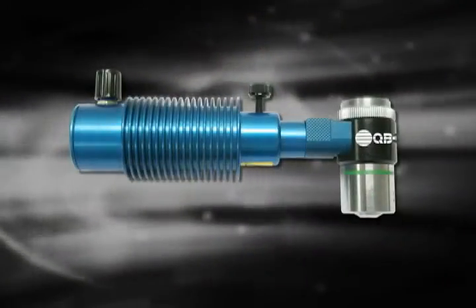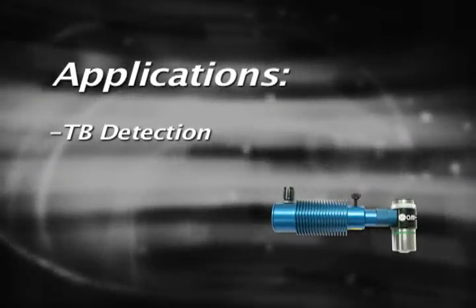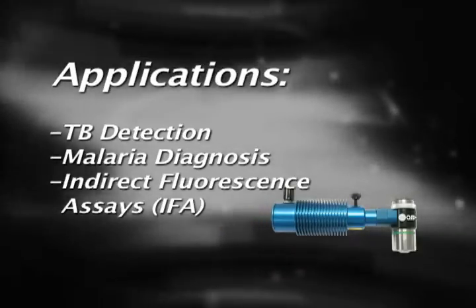The QBC Paralyns Advance is a microscope attachment which can transform almost any compound light microscope into a fluorescent microscope. With its broad range of applications, the Paralyns Advance can be used for TB detection, malaria diagnosis, and indirect fluorescence assays.